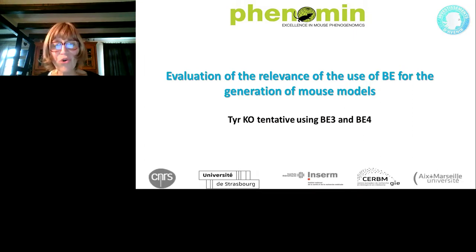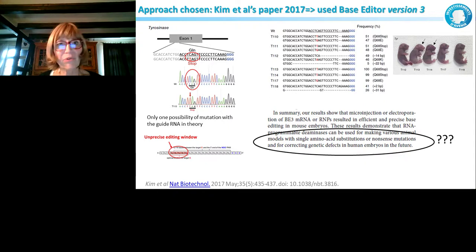So we decided to go and test the base editor, the cytidine base editor, on tyrosinase, and two versions of this base editor, base editor 3 and base editor 4. And that's what we did. Here, we use this paper; you have the reference, it's a Nature Biotechnology paper, and you can see the approach that they used. For tyrosinase, what they wanted is to generate a stop codon. If you mutate tyrosinase, you should have animals that are not black anymore if you work on black 6 animals, but they go white if you target both alleles. Then the base editor goes from a C to a T, generating a stop codon.